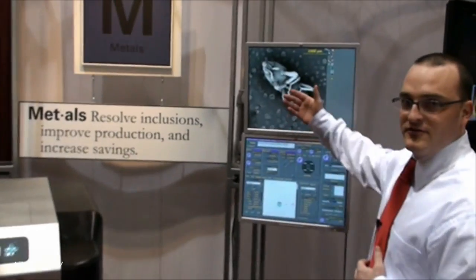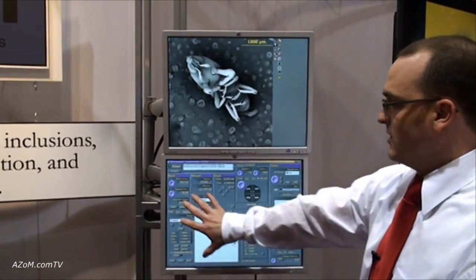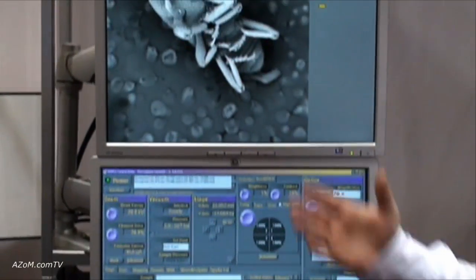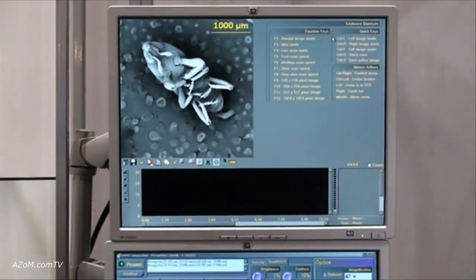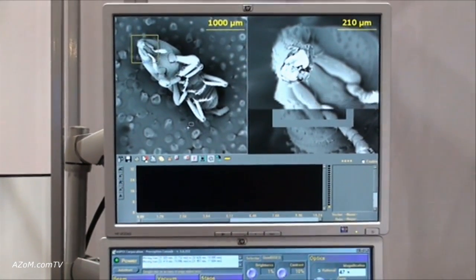Going back to the interface, we have a two-monitor display meant to be very user friendly. One is the Perception Console where you have all the controls for the electron optics, and on the top we have an imaging screen — here we're looking at a bug specimen.